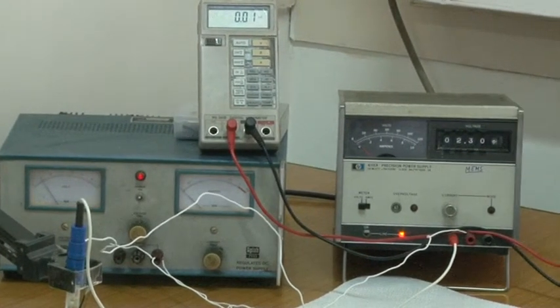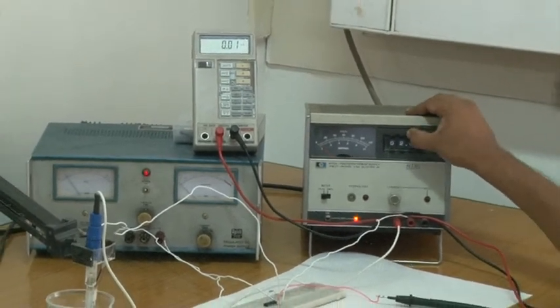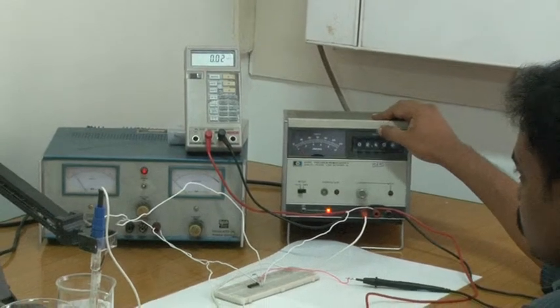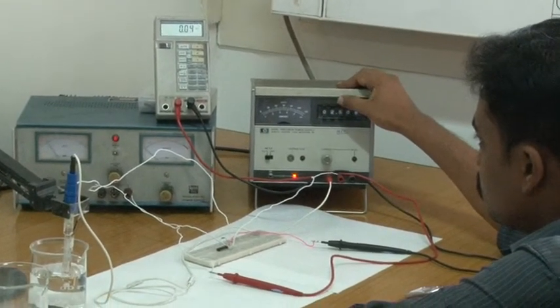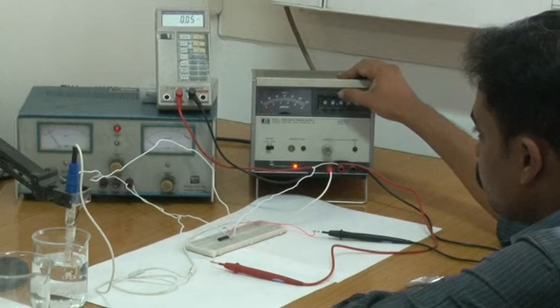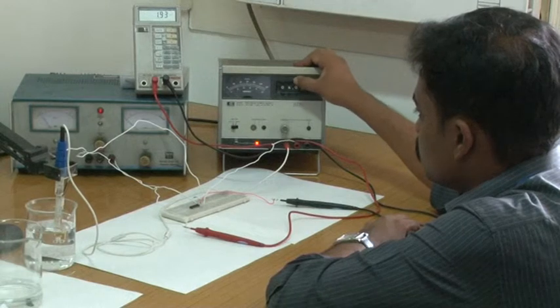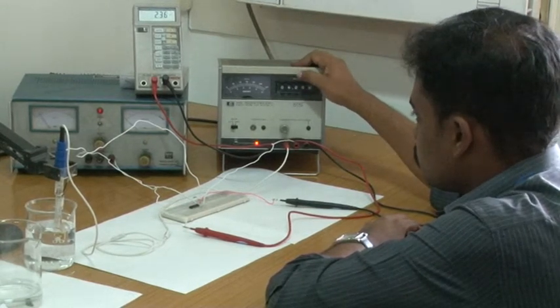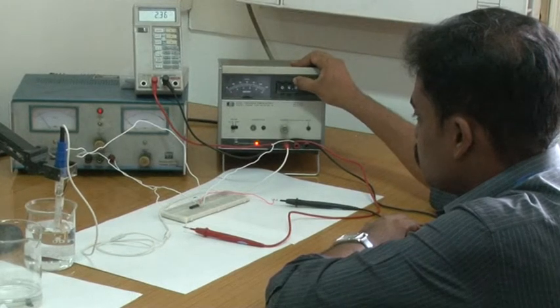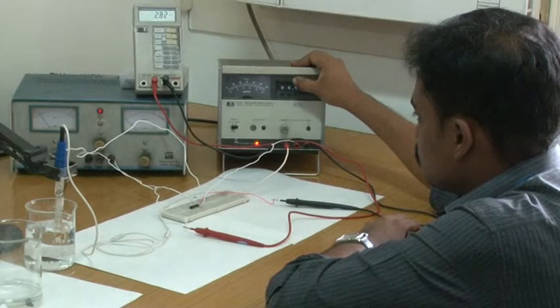For pH 7 solution, for a 2.3 V reference voltage, the drain current is 0.01 mA. The same procedure is repeated here also — we keep changing the reference voltage and observe the drain current for pH 7 as well.